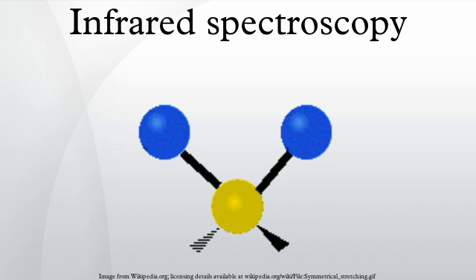The information at all frequencies is collected simultaneously, improving both speed and signal-to-noise ratio. Another is called Jacquinot's throughput advantage. A dispersive measurement requires detecting much lower light levels than an FTIR measurement. There are other advantages, as well as some disadvantages, but virtually all modern infrared spectrometers are FTIR instruments.